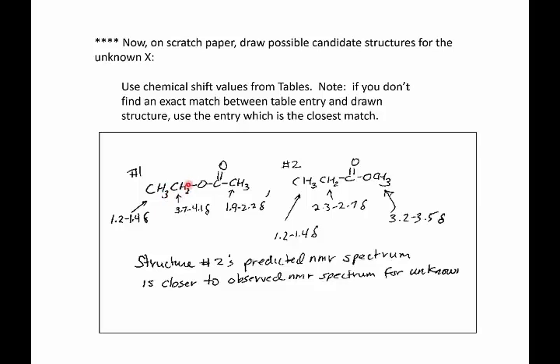All right, so this is one possibility. CH3 bonded to the carbonyl group, bonded to the O, then the ethyl group. All right, what else? What other possibility is there? Well, this over here, and that's structure number 2. It is an ethyl bonded directly to the carbonyl carbon, and the carbonyl carbon bonded to O, and then CH3.